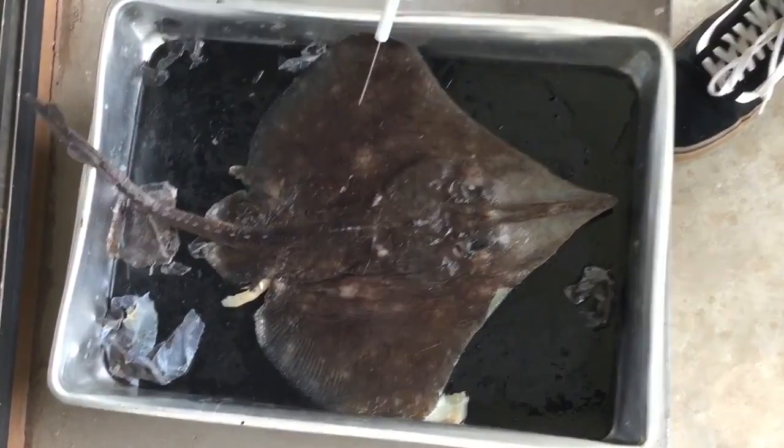Hi, my name is Nick. My name is DP and we're about to dissect a skate. I'm Nick and I'm doing the external part of the skate.